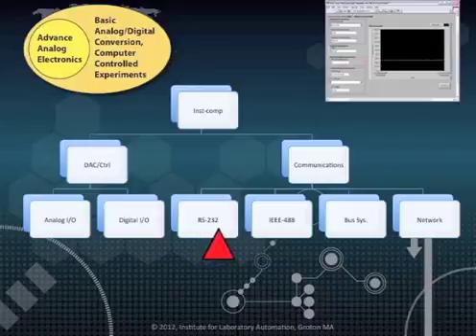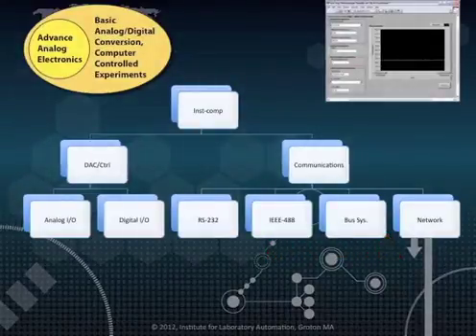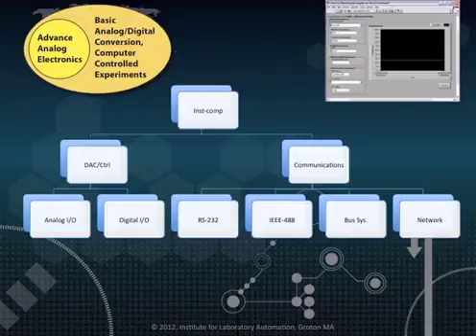The IEEE 488 instrument bus is commonly used in electronic test systems. For a short time it was tried in chemical laboratory systems, but never really caught on. It is an excellent system for controlling communications between intelligent instrument devices. With the availability of reduced-cost bus-based systems and network systems, such as the USB buses and Ethernet, instrumentation can directly connect to networks and operate as fully intelligent devices.